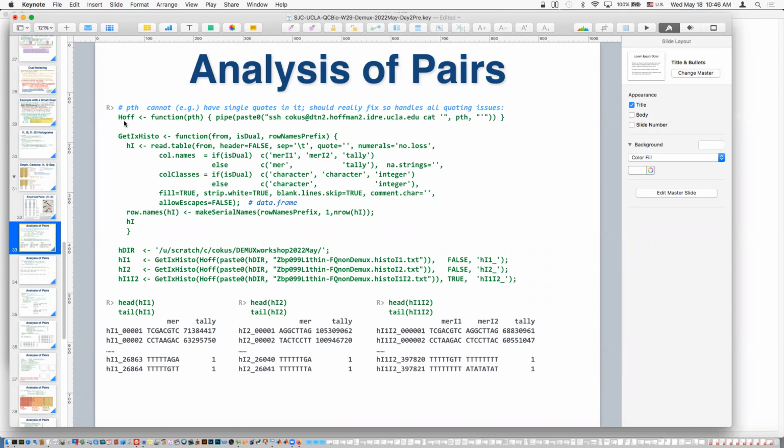So basically what we're going to do is exactly the same thing we've already done for the single end analysis, but we're going to do it independently, straight up single end analysis like we've already done on I1, then on I2. Then we will look at our pairs, process the pairs via the I1 analysis and the I2 analysis, and then tally up a matrix using those little single end analyses and make the paired matrix. And then we'll look at the matrix and make some decisions.